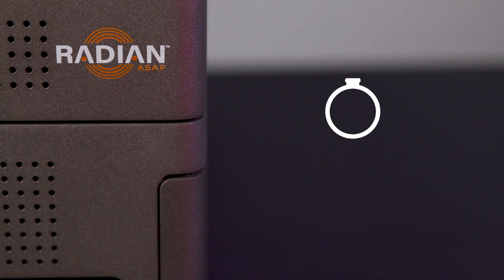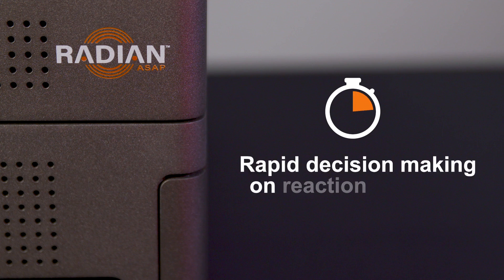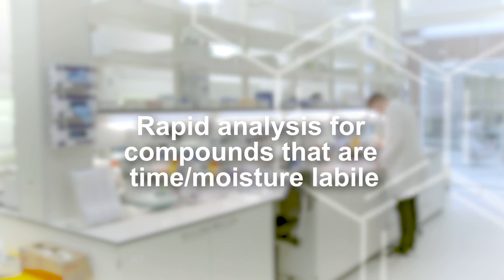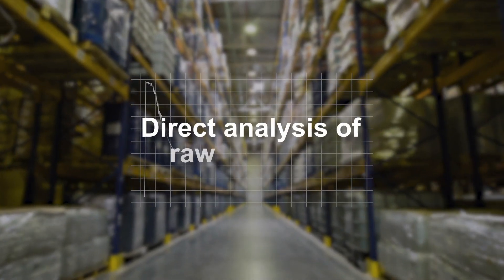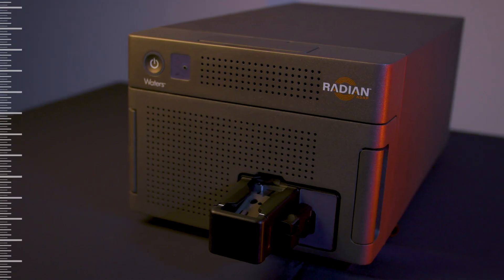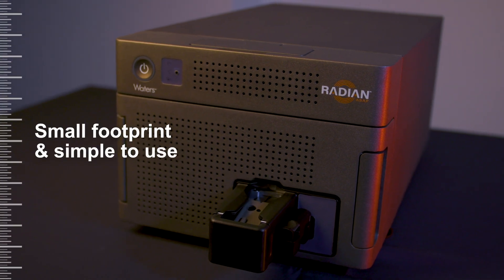The advantages of the radian ASAP: rapid decision making on reaction progress, rapid analysis for compounds that are time or moisture labile, direct analysis of raw materials, analysis of purification fractions. The radian ASAP also has a small footprint and is simple to use.